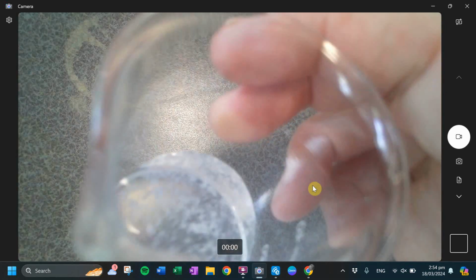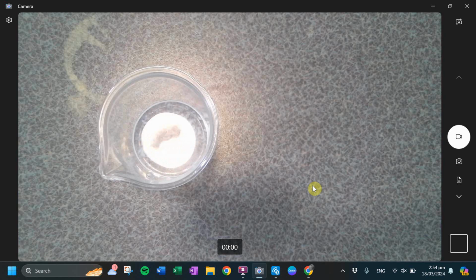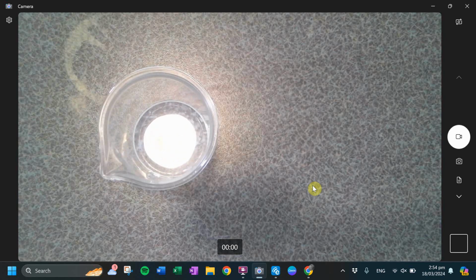And you should get a white precipitate again. It's kind of like jelly-like. Do you see how that precipitate is slightly different than the one you saw in the last one? They're all white, but it's a different type of white. It's more gel-like, right?